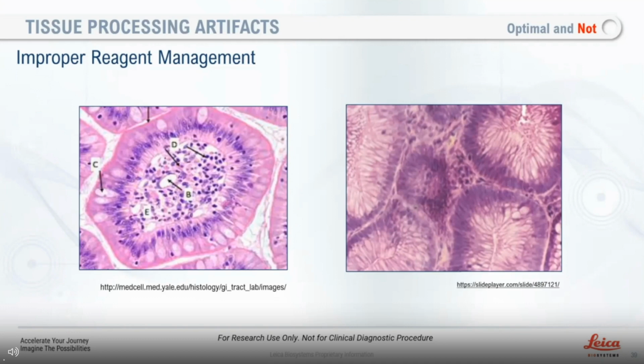Thank you. You bet. Next question. What are a few possible causes of reagent artifact resulting in poor tissue processing? I think the number one thing that comes to mind, and I saved it for the last of my presentation, and it's the most common thing that I see in the field, is maintenance. Changing the reagents, checking the reagents. If you're making formalin up in the laboratory, checking the pH. I think it's all around the integrity of those reagents that you're using.